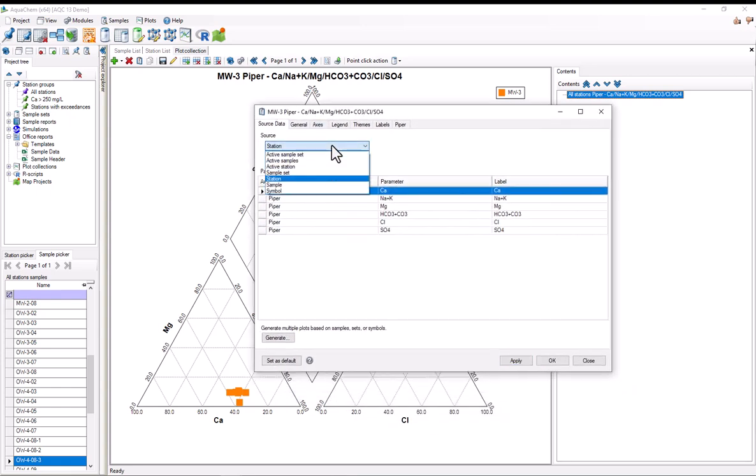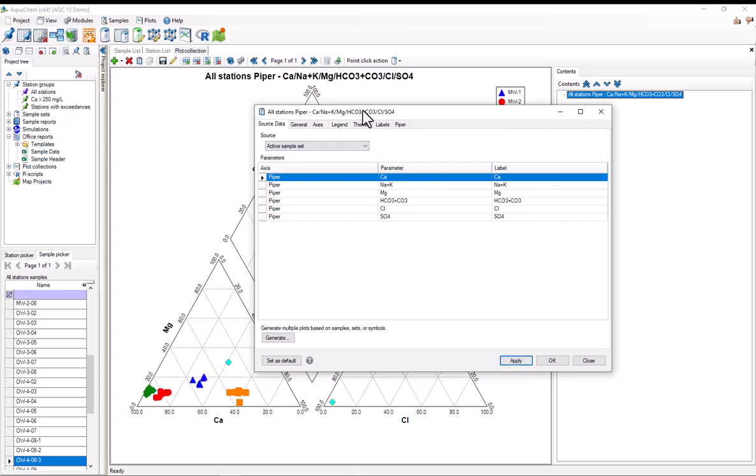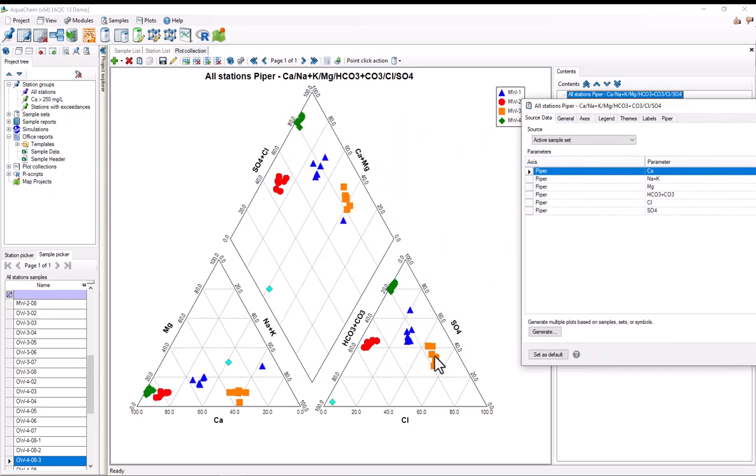I'll put this back to the active sample set. Now I'll show how to customize the axes on these plots. Most Piper diagrams have the major cations in the ternary diagram on the bottom left, and on the bottom right, they've got a ternary diagram with the major anions. However, these plots can be customized arbitrarily.